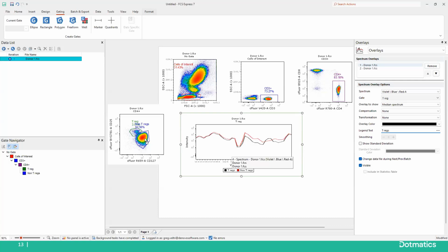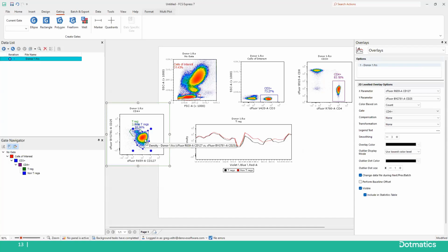All right, so now this is all live. I can move these and see where they are. So what's nice about this is that if you were trying to kind of figure out where your gates should be, or you wanted to give a spectral representation of the cells. Now, we don't all do cells. Some of us do bacteria, some of us do phytoplankton and other things that give off different types of fluorescence. You would be able to show that on this curve.